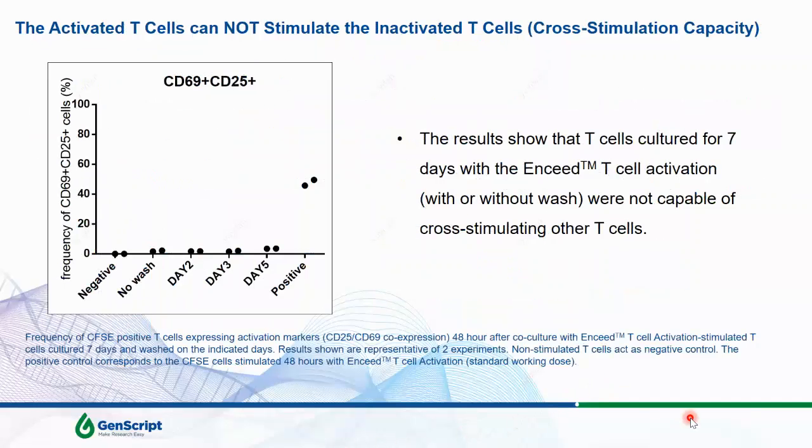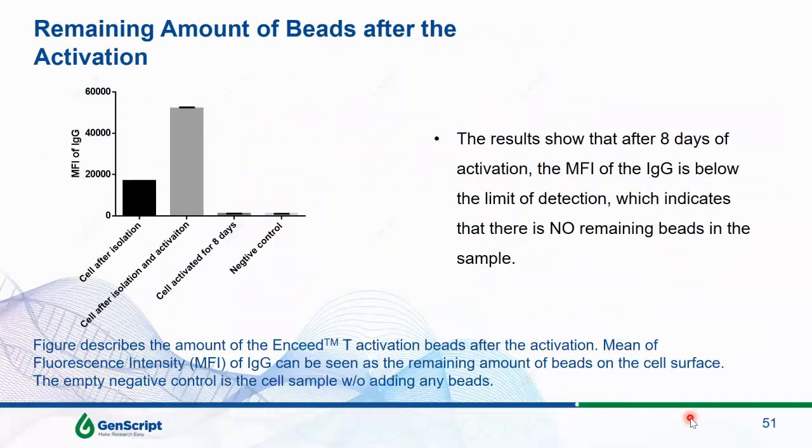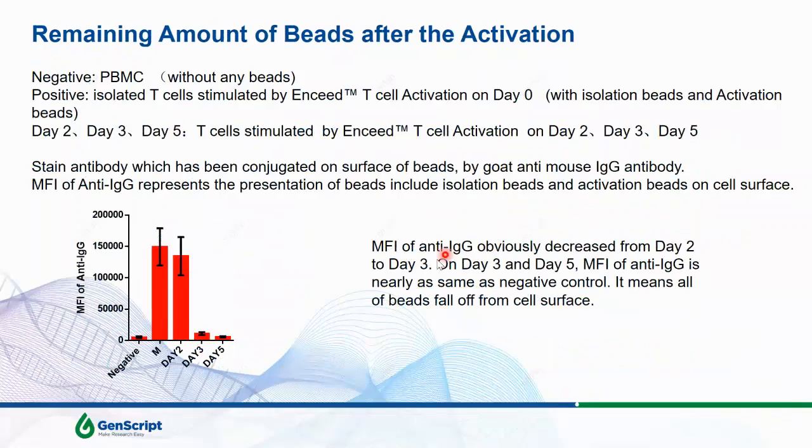Here is some more relevant data, a side-by-side comparison between our beads and after activation for a certain amount of time. You can see that after 5 days, there's no remaining amount of the beads after the activation.